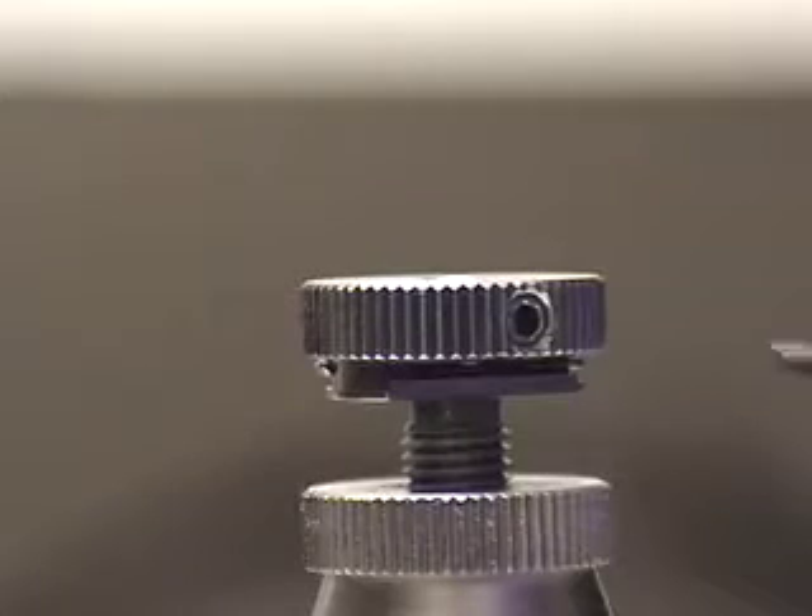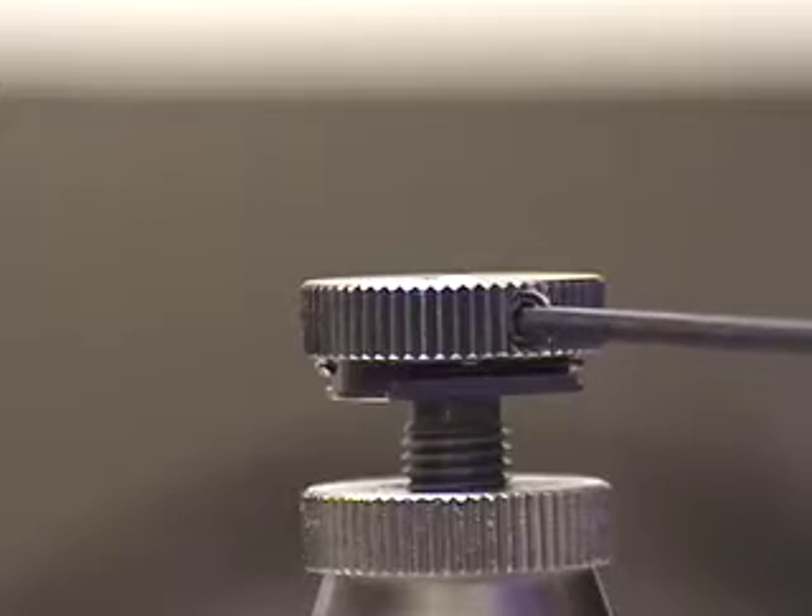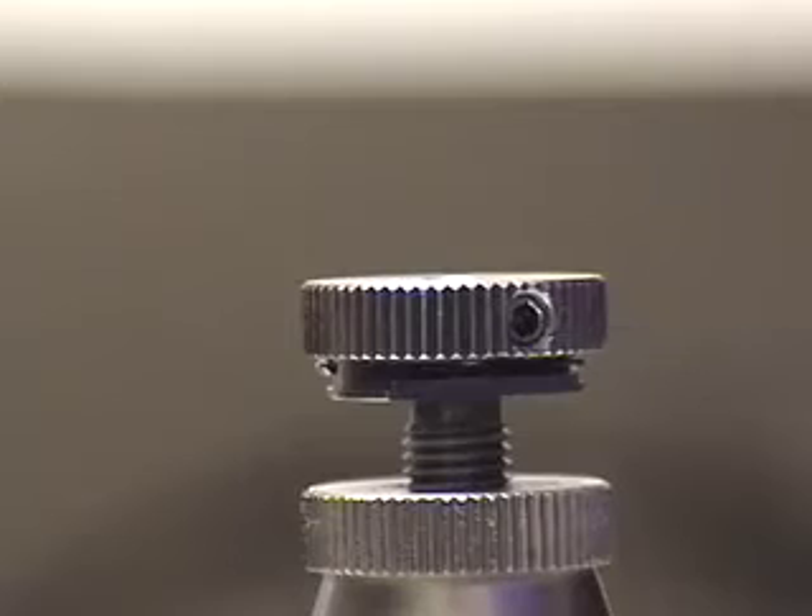Earlier you may have noticed a small set screw in the top of the sample holder, which may be tightened gently to hold the sample firm.